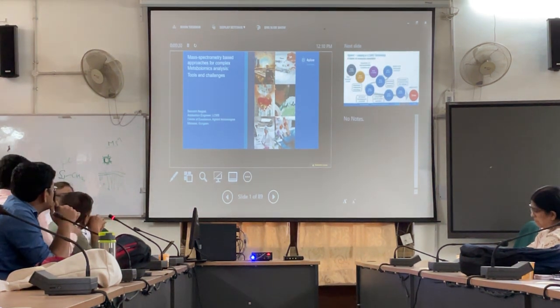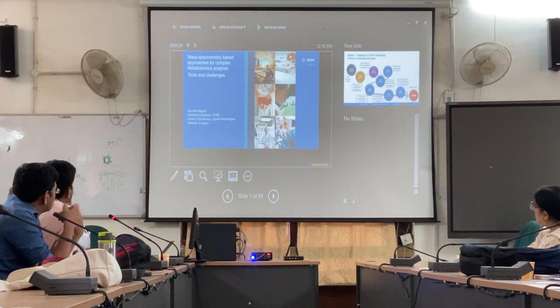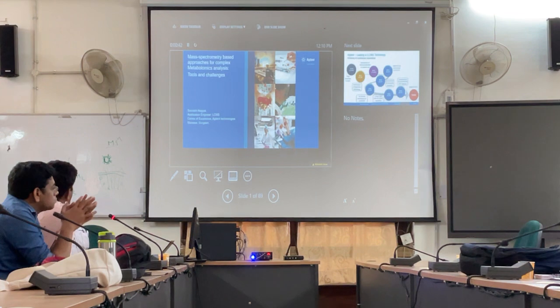And you have to look at it in totality. Mass spectrometry, when coupled to LC, why are we coupling it? Otherwise, we can use HPLC alone and mass spec alone. Each instrument has its own advantages and disadvantages.